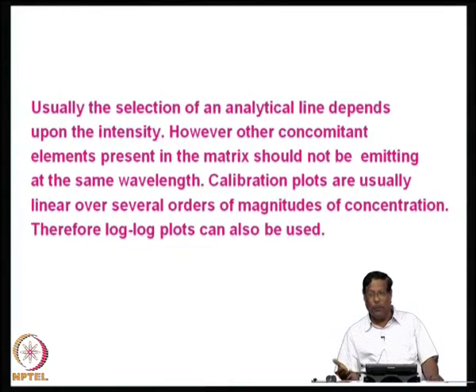Unless you know about the matrix, what are the different kinds of elements, you will not be able to know which element or what species is causing interference, because what you are seeing is only the total number of counts.